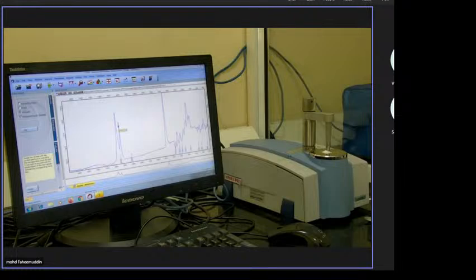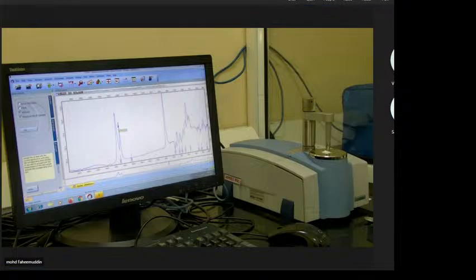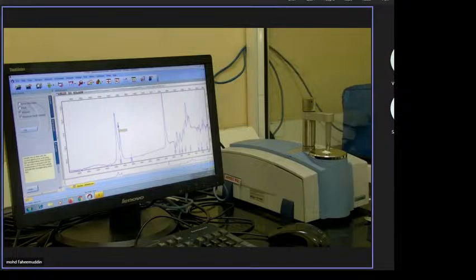What you are collecting could be salicylic acid again, washed salicylic acid. How can you say that aspirin is generated, that the reaction was carried out and proceeded? Because aspirin is a well-known molecule, we have some physicochemical data: aspirin's melting point, color, boiling point. By checking all these things, we can say that maybe that is aspirin.